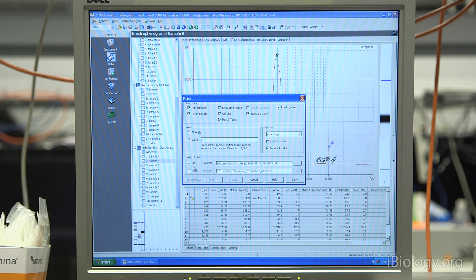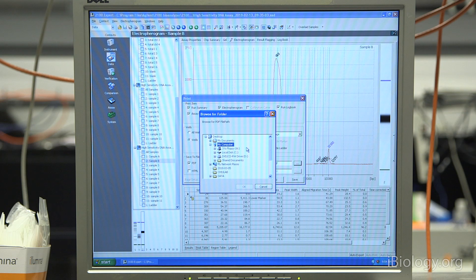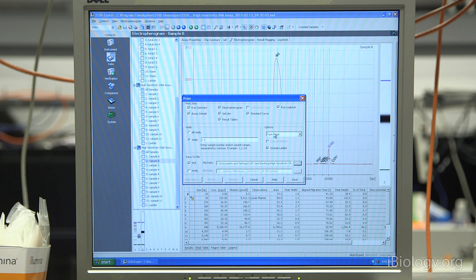You have options to export this as a PDF or an HTML file and to select the directory that you want to export this to. I'm just going to save it to the desktop to make it easier to find. You have options to put four sheets per page or one sheet per page. I'll go ahead and save this.